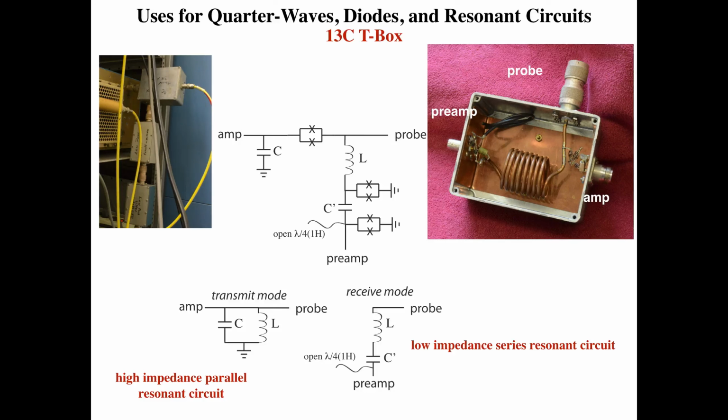Now there's another way to protect preamps without using a quarter wave if you so desire, and that's to use a T-box.